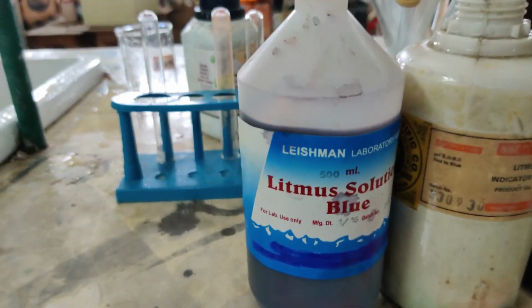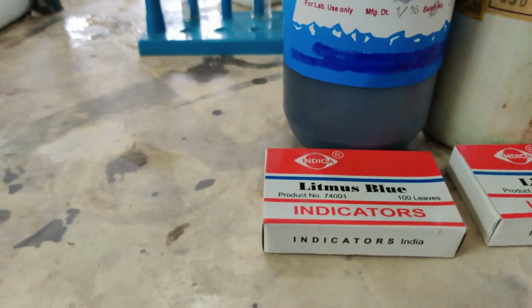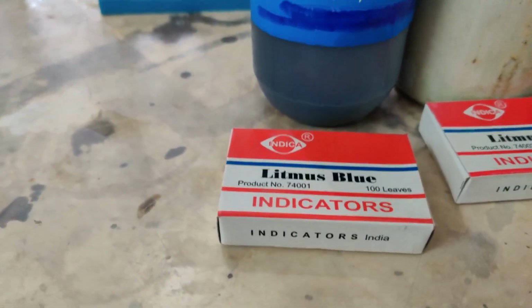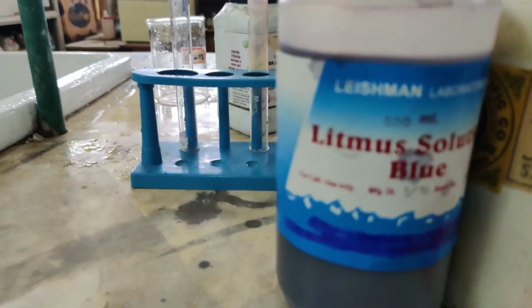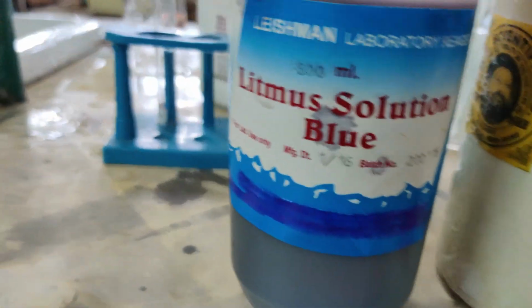You can see the first one is blue litmus, and usually people know litmus as a paper. So here is the paper. This is what the litmus paper is. Inside this you have the paper, and I can show you a little later how a paper looks. But the real litmus is this one, blue litmus. As you can see, a blue solution is inside. We call it litmus blue.